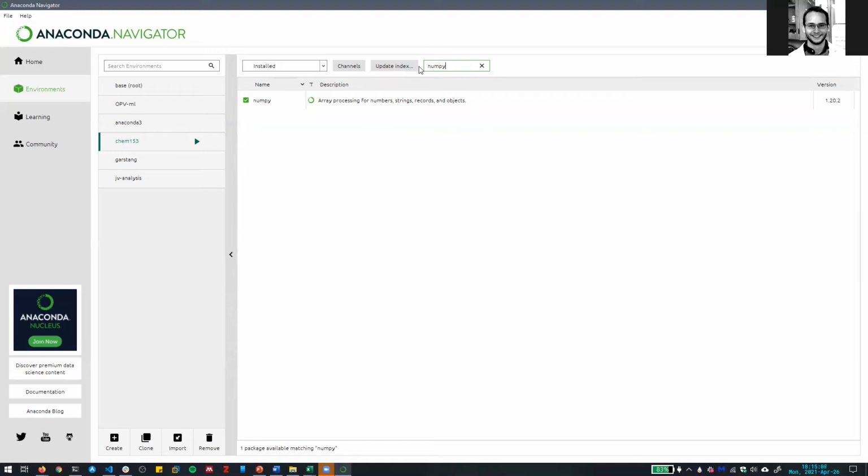So thumbs up, how many people are at the stage where you've made a new environment and you're looking for the packages to install now? I'm on the blue bar for creating the environment. You're on Windows, so... Yeah, I am. Yeah, for some reason it's really slow from this Navigator window. I don't know why, but yeah.